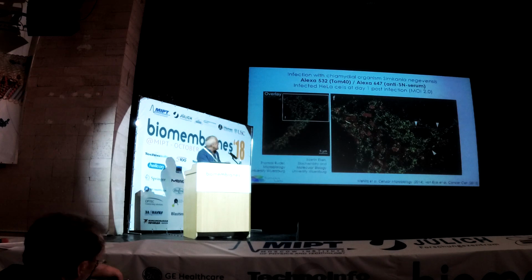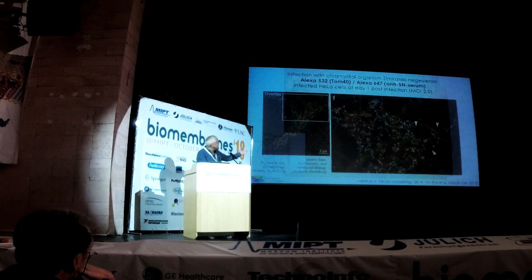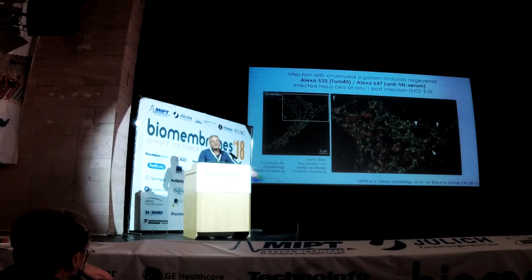Thomas Rudel, who is a microbiologist, where we investigated the infection of these cells by chlamydia, and how they then fuse together, these bacteria, surround the mitochondria and destroy the substructure of mitochondria. It looks quite different than these images. The mitochondria are destroyed by these bacteria.